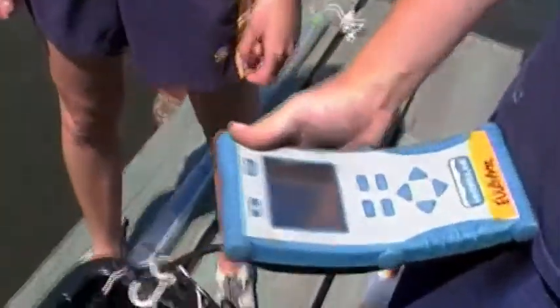Once at desired depth, look at the sensor screen. You can look at different parameters, such as specific conductivity, pH, DO, and temperature. Once you have recorded the data on your datasheet, then bring the Hydrolab up.